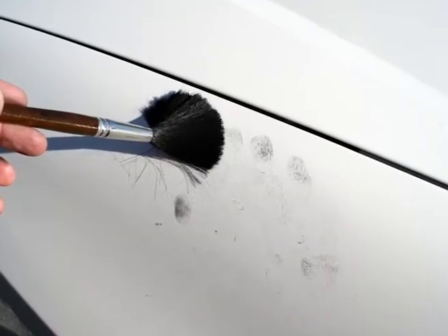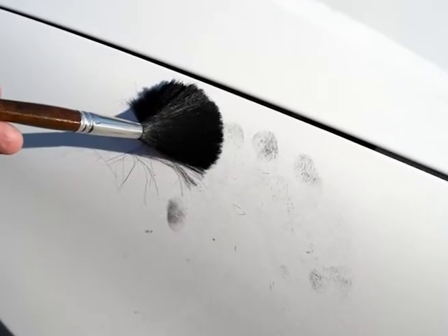Next, we will be taking here up the physical parameters. Ninhydrin is applied to the surface impinged with the latent fingerprints generally by spraying, swabbing or dipping. Of these, dipping operation is the most extensively used. However, fragile paper items such as paper napkins tear apart on dipping and therefore the spraying procedure is followed.